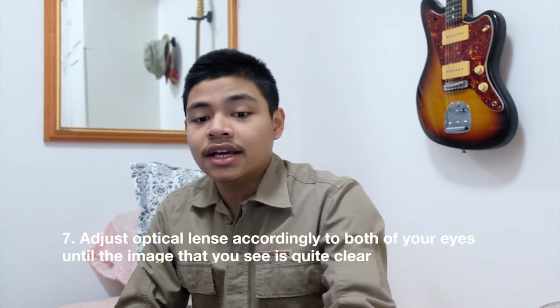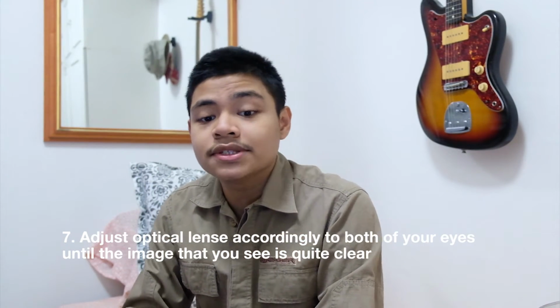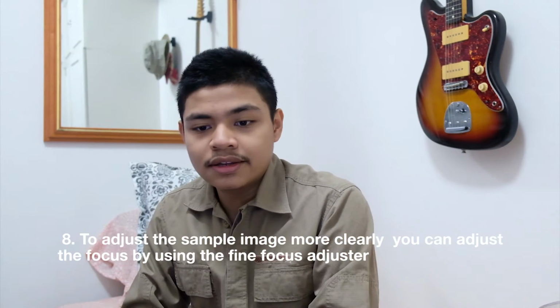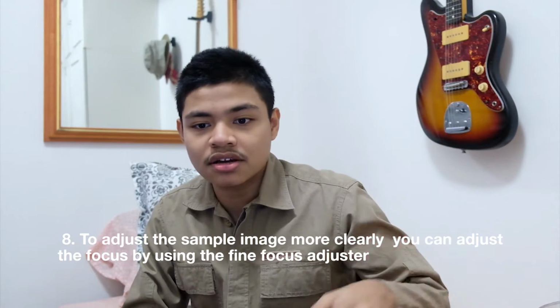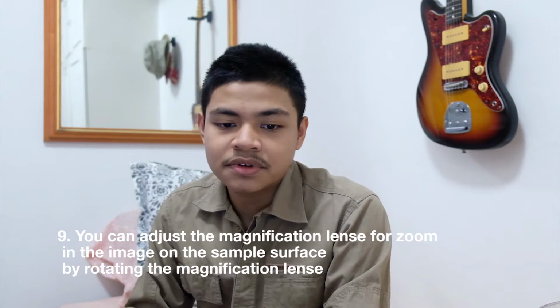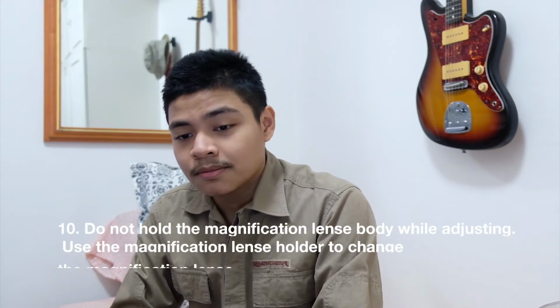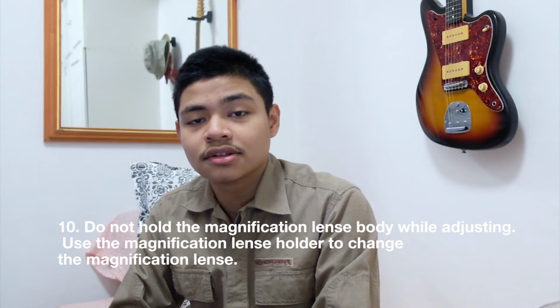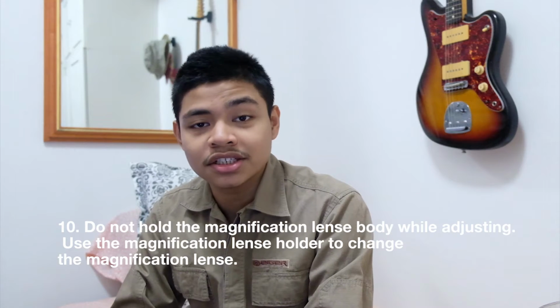Number 7, adjust the optical lens accordingly to both of your eyes until the image that you see is quite clear. And number 8, to make the sample image clearer, you can adjust the focus by using the fine focus adjuster at the left side of the microscope. And number 9, you can adjust the magnification lens to zoom in the image on the sample surface by rotating the magnification lens. And number 10, please do not hold the magnification lens body while adjusting. Use the magnification lens holder to change the magnification lens.